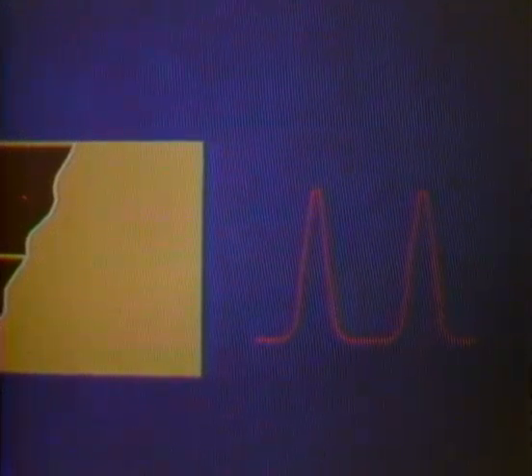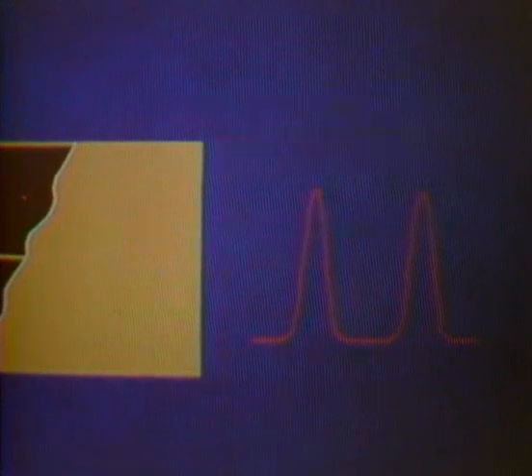The separation factor can be increased by proper selection of the stationary phase. However, a large separation factor does not of itself assure good separation, because diffusion of the bands as they pass through the column may cause overlapping and thus reduce the separation. The greater the number of equilibrium steps, theoretical plates, the greater the separation or resolution.